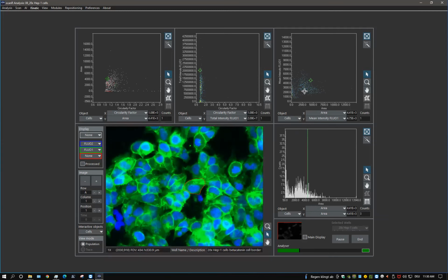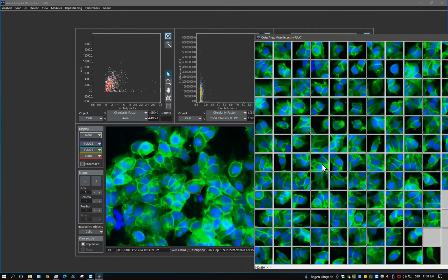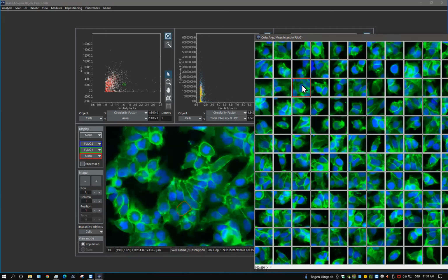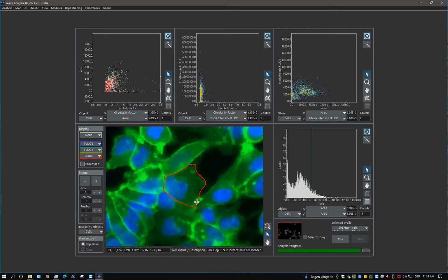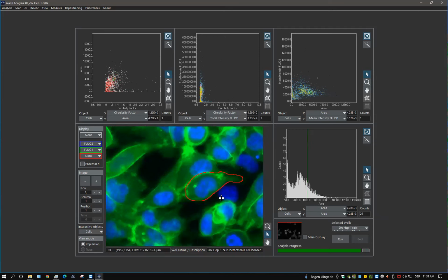So what it does here is also amazing, at least for me, who has spent a lot of time to analyze this kind of structures with classical means. So the pre-trained neural network gives here a really good prediction of cell shapes. So for example here, okay, this is not good. This is a double detection. I would say this is too challenging to expect a perfect result.